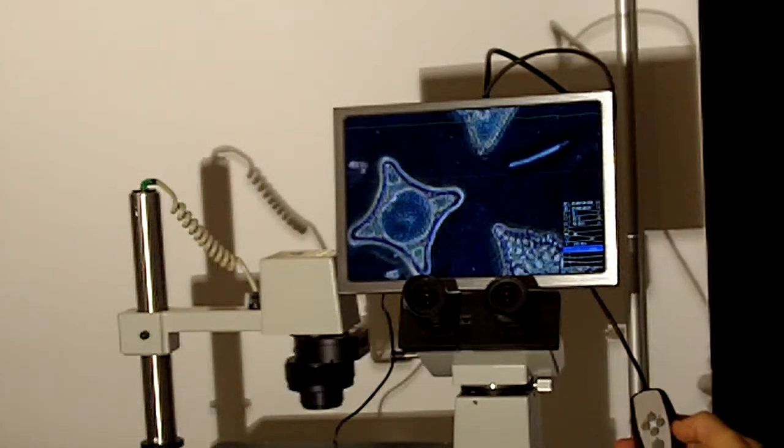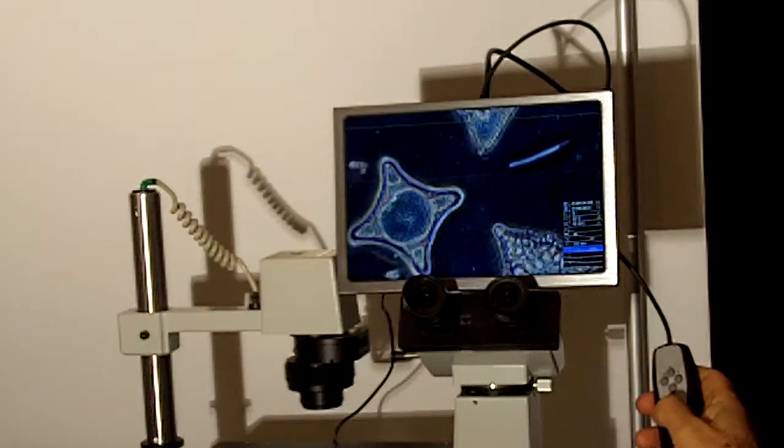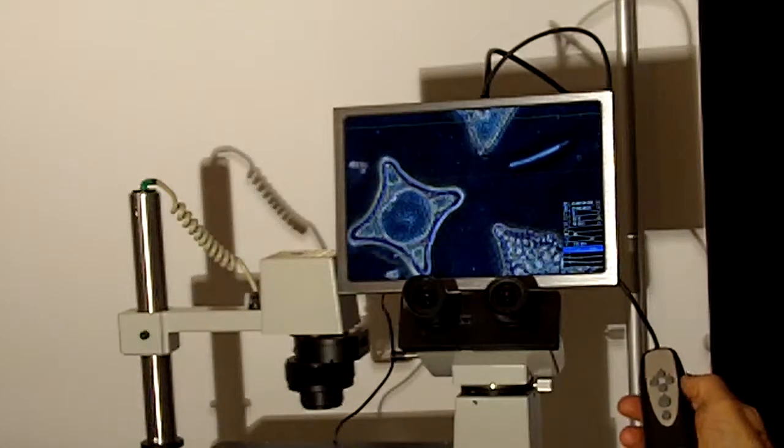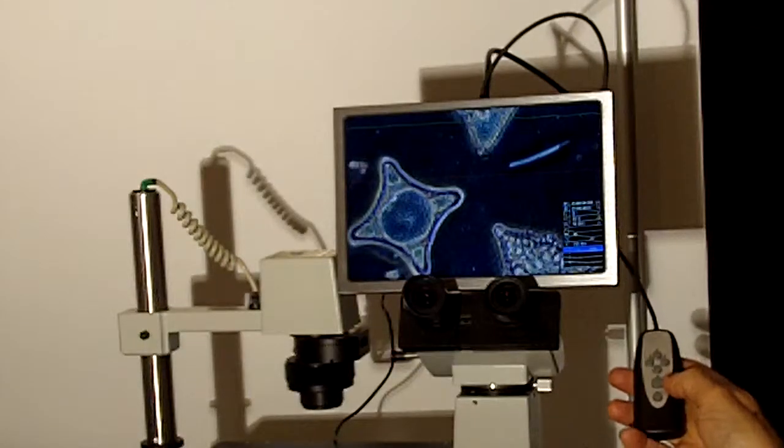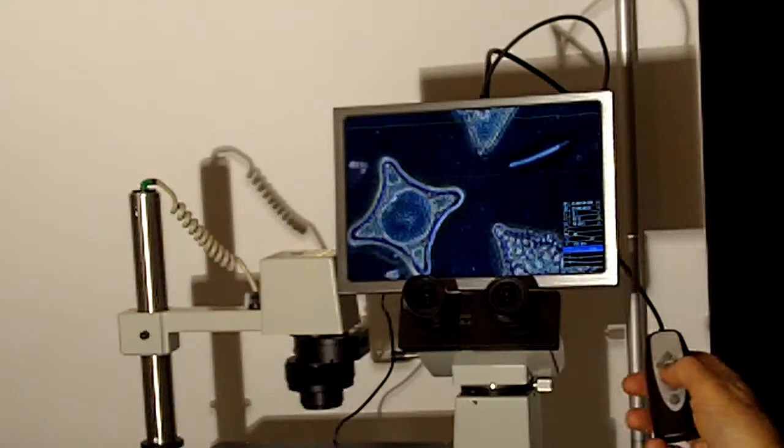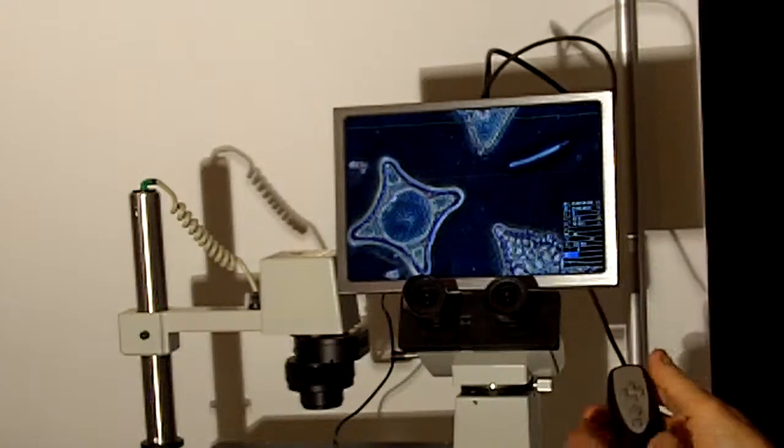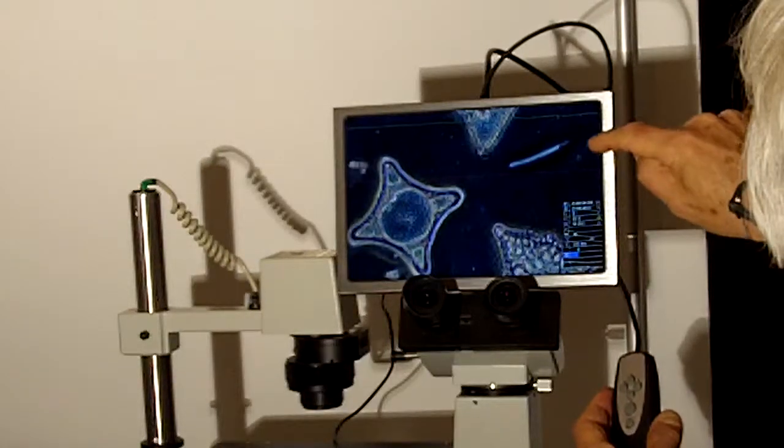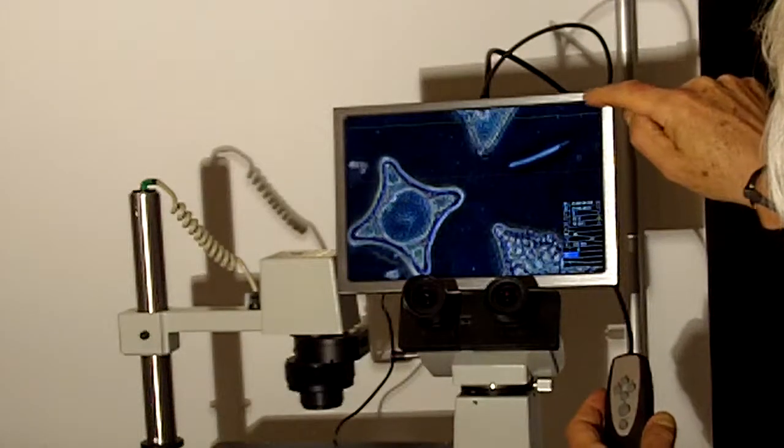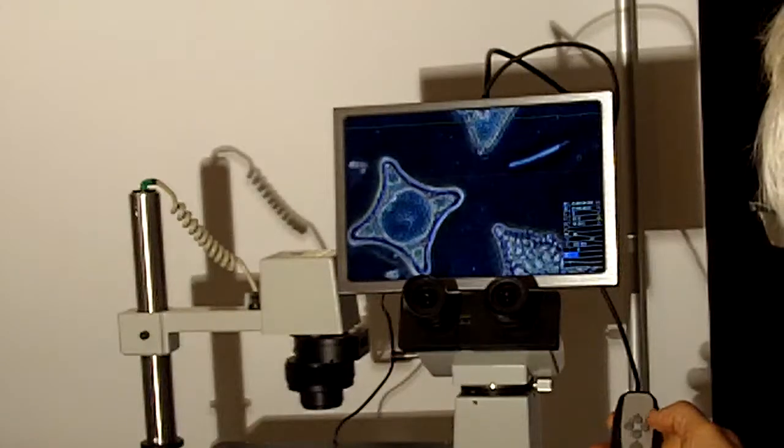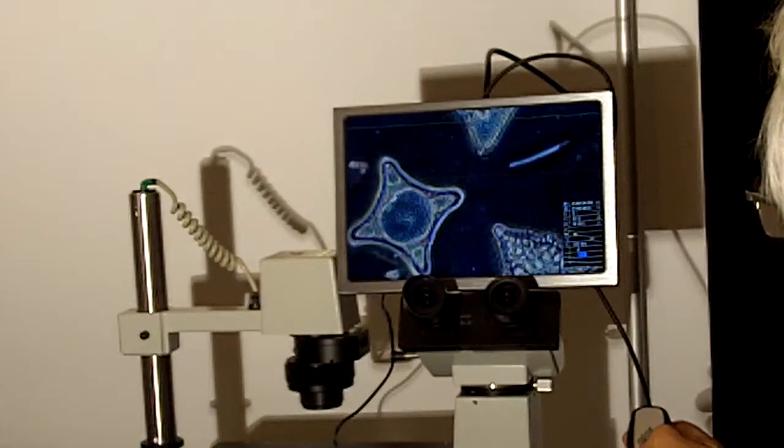We can take a photograph at any time in photo mode. For many industrial applications, we can introduce horizontal and vertical lines—up to four horizontal and four vertical.